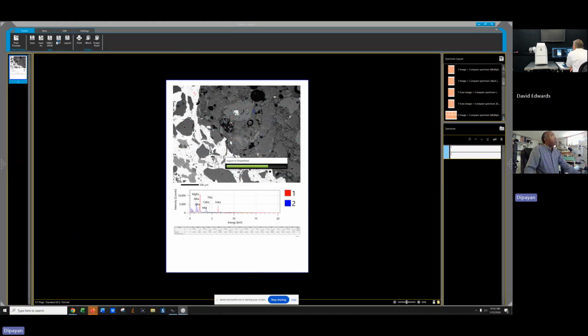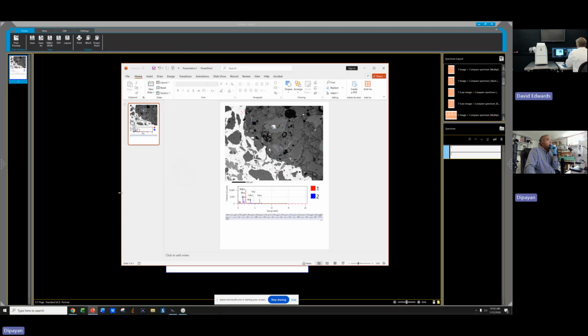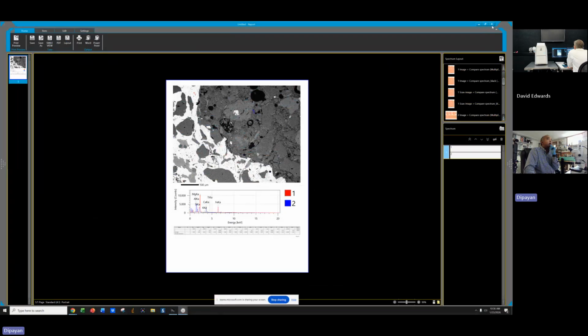Yep. Okay, so that save you are telling me to skip, because that is what I was wondering, because that save is going into the Neoscope system. Yeah, yeah, okay, got it. Yeah, that's what I don't need to do. Okay. Right. You have the data, you have the PowerPoint, you don't need this view in the middle. This is just an immediate thing. You can throw that away. Yeah, this is the one I saved. Correct. This is the one I saved. Okay. Got it. And this, we have our own.